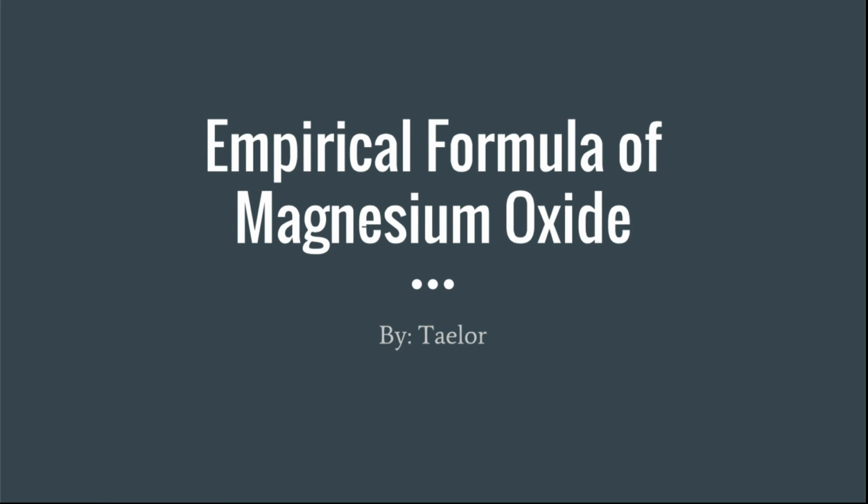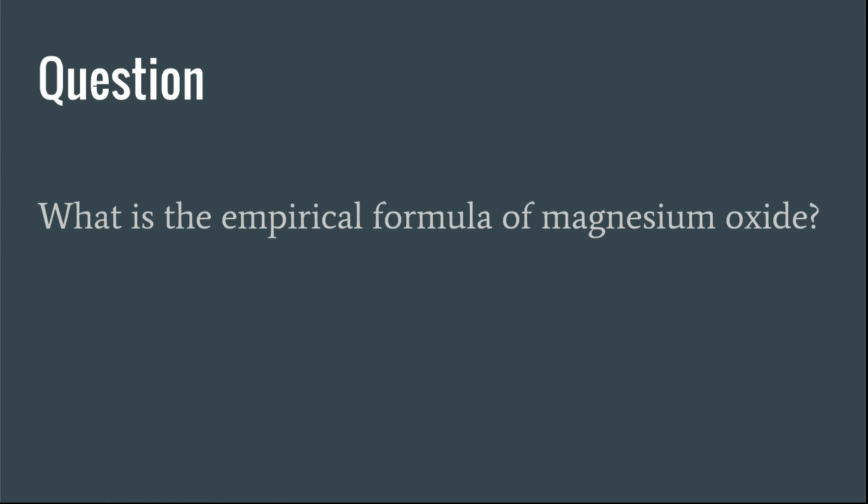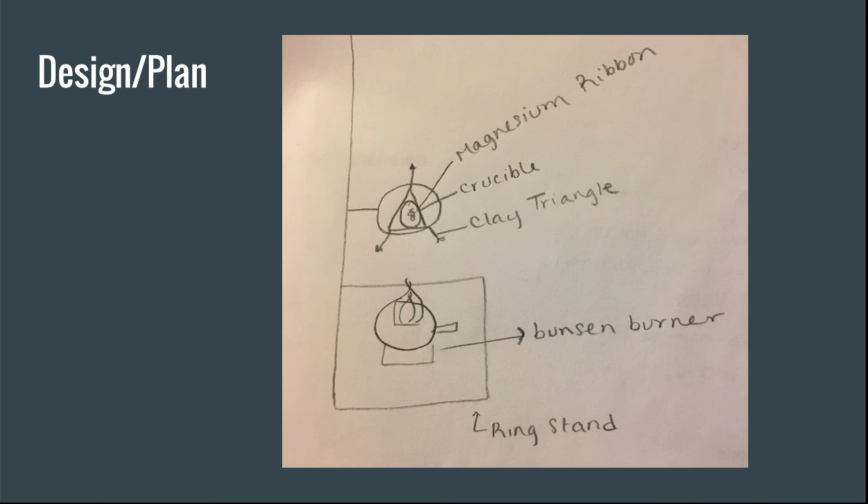Hi, my name is Taylor, and this is my experiment for the empirical formula of magnesium oxide. My question was, what is the empirical formula of magnesium oxide? This was my design/plan.